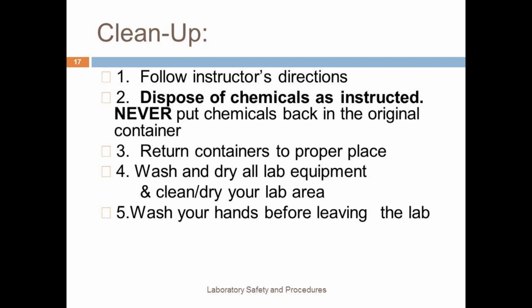After lab, you must clean up safely. Always follow the teacher's directions. For every lab, we will give you specific instructions on how to dispose of the chemicals that we use that day. Never put those chemicals back in the containers that they came in because that will ruin our stock chemicals. Return everything else back to the proper place, so basically make the lab look like it did before you started.